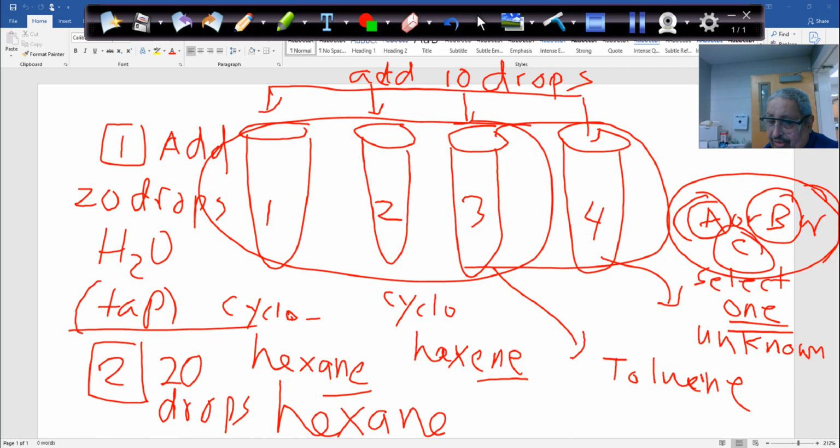So you write your observation. That's a physical property of those compounds. Those 3 compounds, hydrocarbons, are not polar. They are soluble in non-polar solvents such as hexane, and not soluble in polar solvents such as H2O. Okay, guys, everybody agrees? So that is now a physical characteristic of those hydrocarbons.